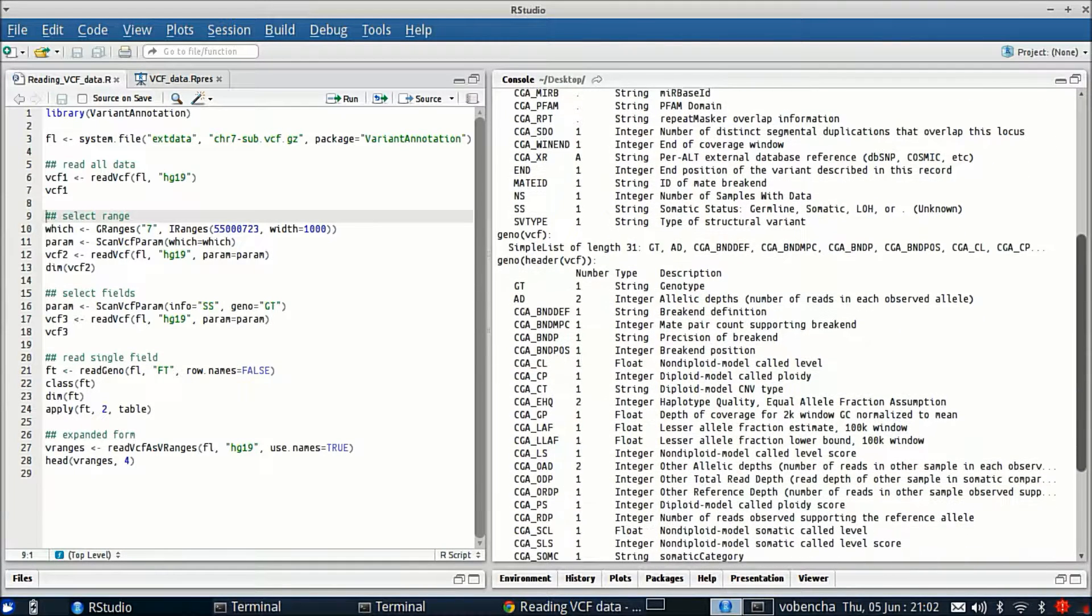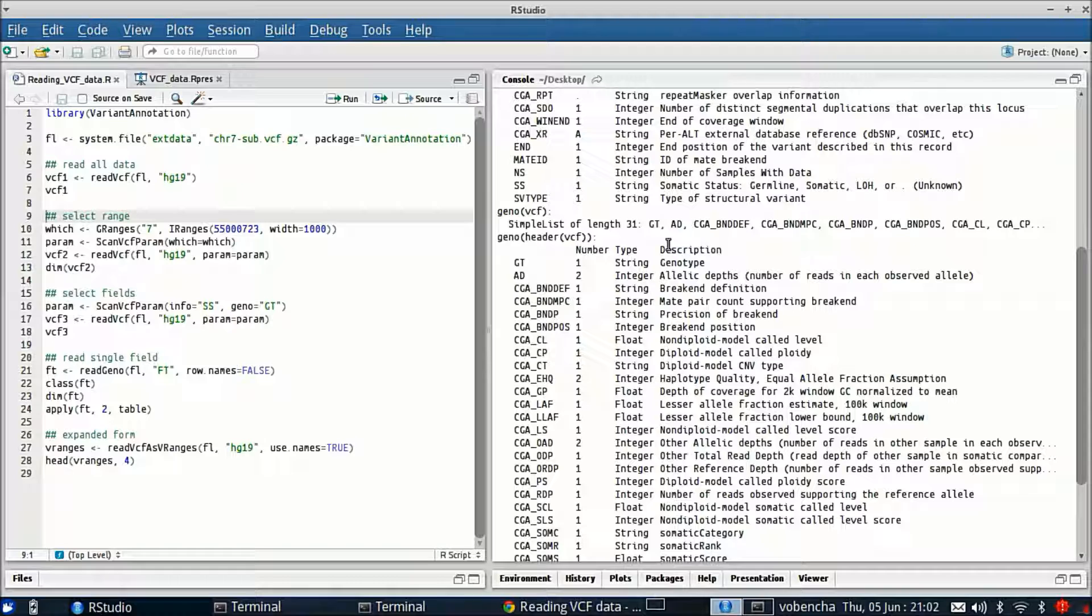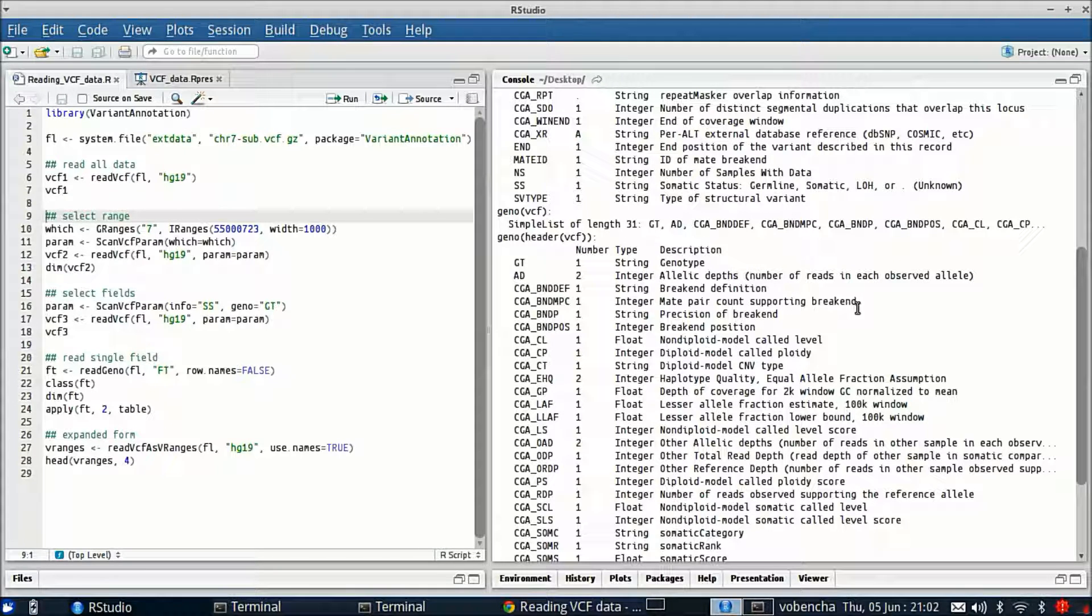Looking down now at the genome we see that we have a list of 31 variables in the genome slot and again all of the header information is accessible to us.